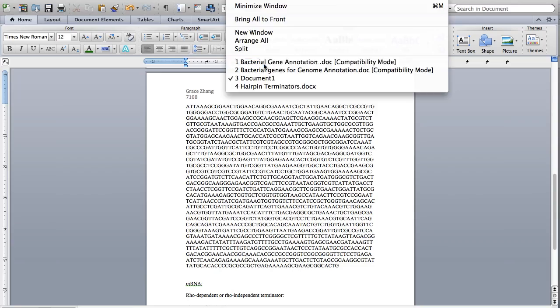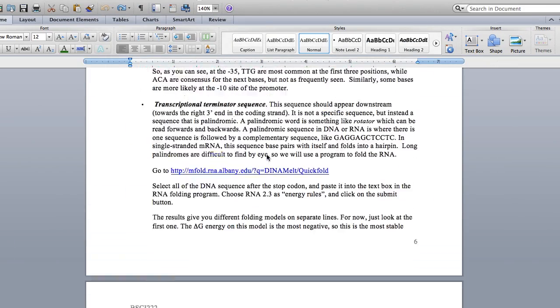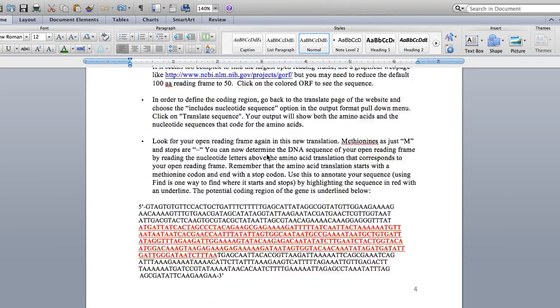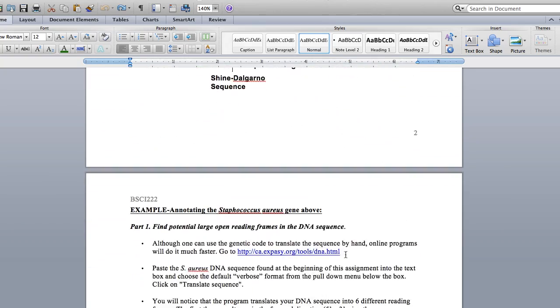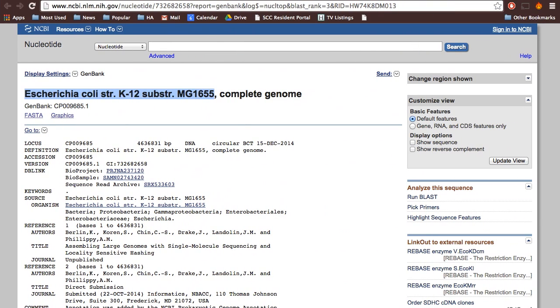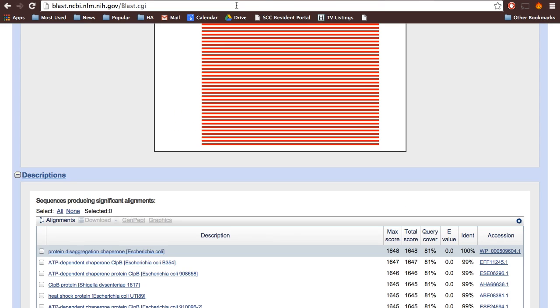So we're going to go look for the link to ExPASy. Here it is. Go ahead and copy this, and we're going to paste it. Get rid of this stuff. Let's paste it here.